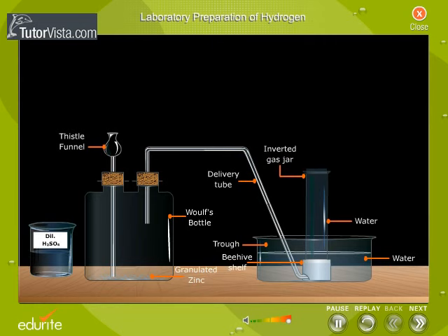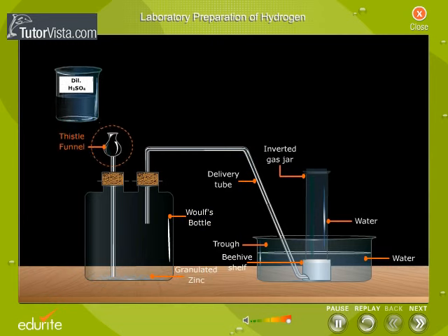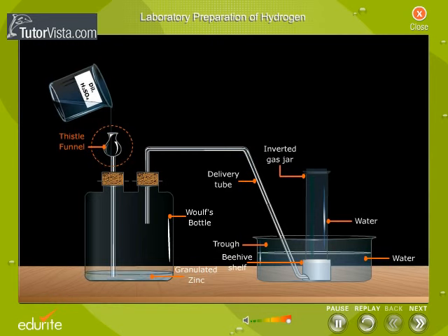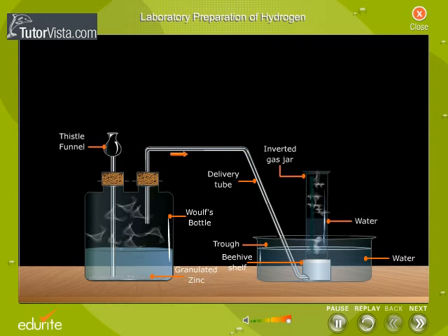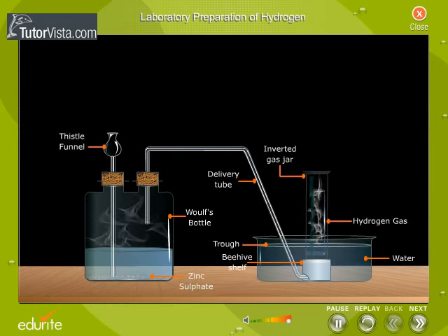Granulated zinc is taken in a wolf's bottle. Dilute sulphuric acid is dropped into the wolf's bottle through the thistle funnel. Zinc displaces hydrogen from dilute sulphuric acid. Zinc sulphate formed is left behind.